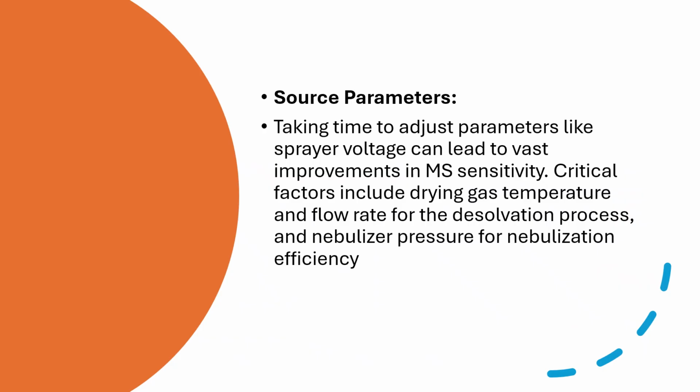Additional source parameters where you can enhance your sensitivity would be drying gas temperature and flow rate for the desolvation process, and nebulizer pressure for nebulization efficiency.